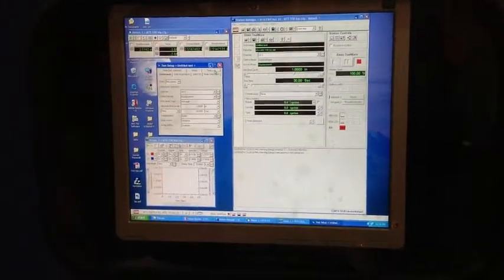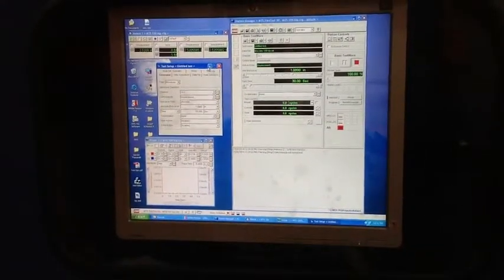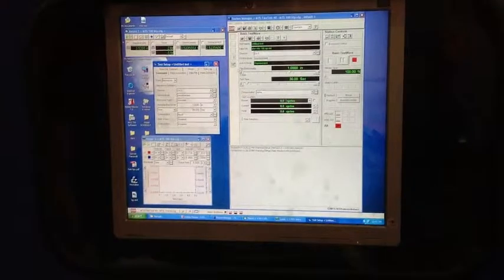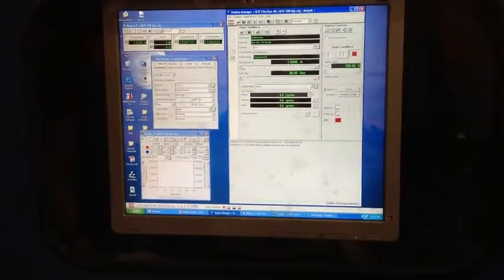You can either minimize this window or you can close it. It's fine. Then you go to this control panel.